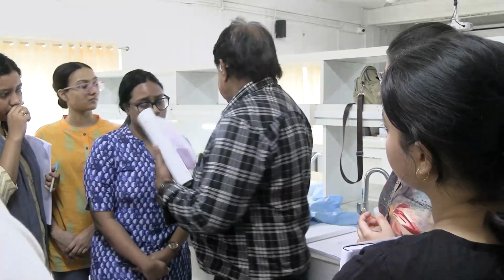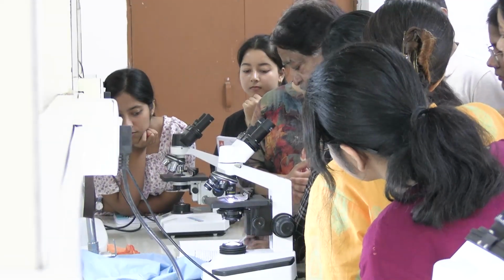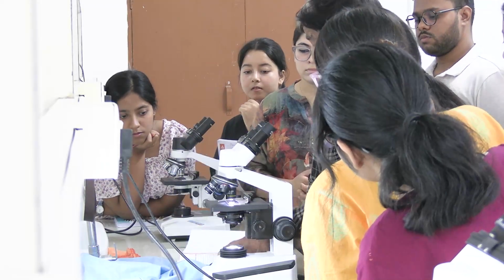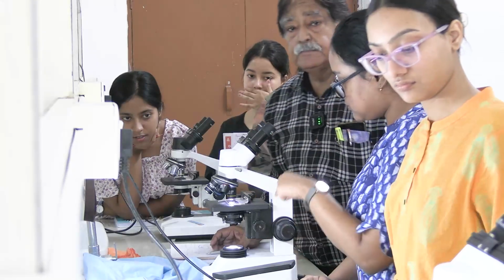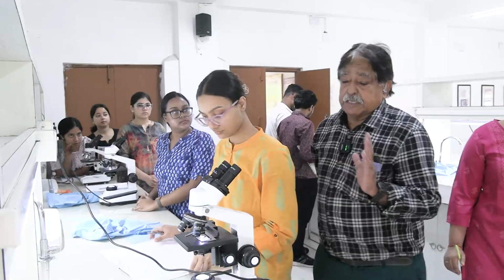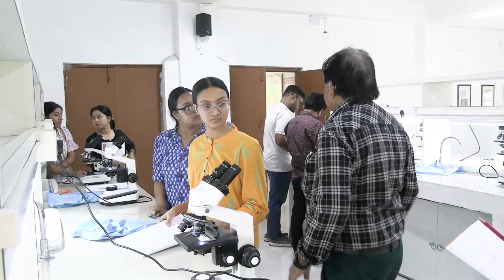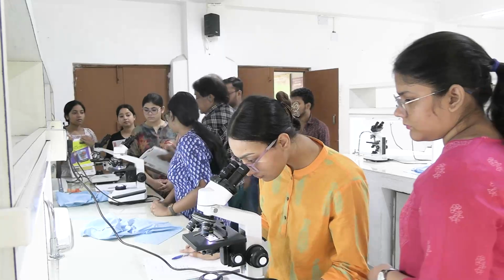Now in the class, when you're coming for your observation of slides and all, you just have this like this, and these are pulp arteries like that. Okay. Similarly, you take out lymph node. Histology textbook you must carry. Now you see this, and you take out one of your books and see lymph node. Now this is the lymph node.